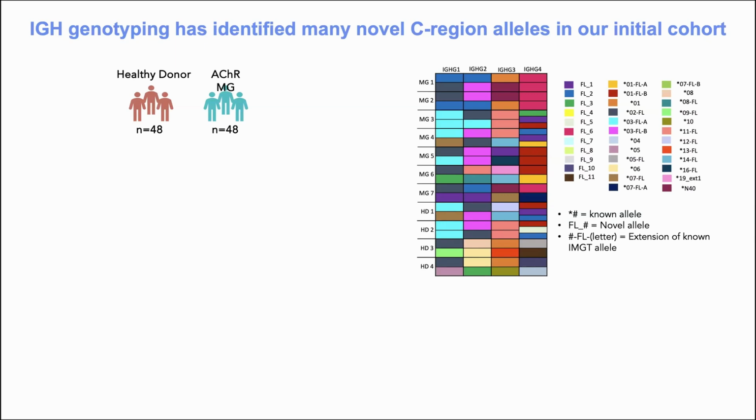It's really important. We also see the presence of more than 2 alleles per individual in some cases. This would be unusual. Initially, we thought this was an artifact, right? We all have a maternal and a paternal allele. But what we did find when we saw this was that there are specific gene cassettes, quite a few actually, enriched in the IgG4 region of the IgH constant region, where there are gene duplications happening as well, leading to the expression of additional alleles in the repertoire. Now, whether that contributes to pathogenesis, if these happen to be more autoreactive, that's still an open and tantalizing question.